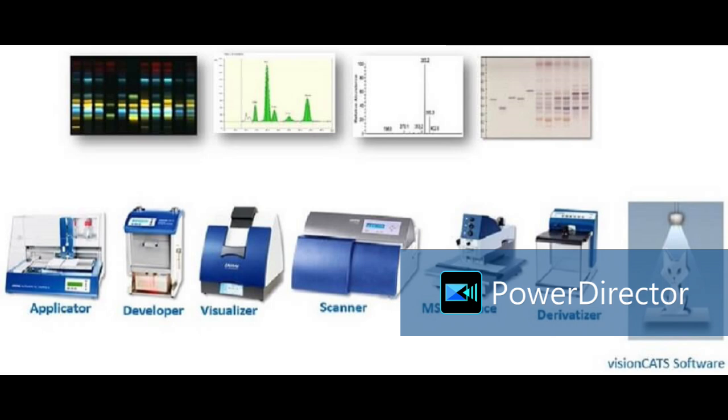These are different chemical warfare agents. Your kit also has a warfare nerve agent. You can see the possibilities with HPTLC to detect these nerve agents from any kind of sample matrix. It is very easy, fast and rapid. You can see blistering agents and irritants, arsenic agents also. And these are active bands, active towards acetylcholinesterase, inhibition zones we can say.